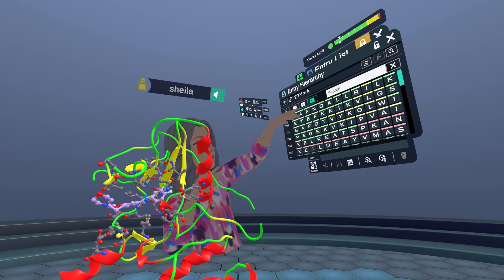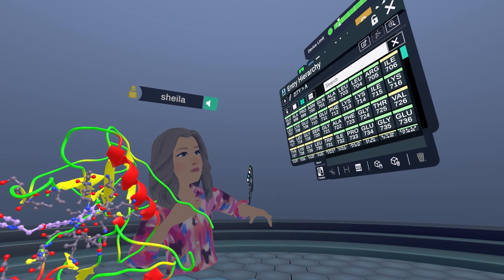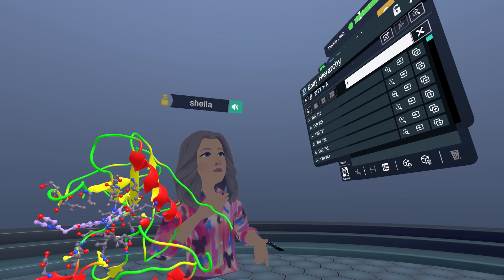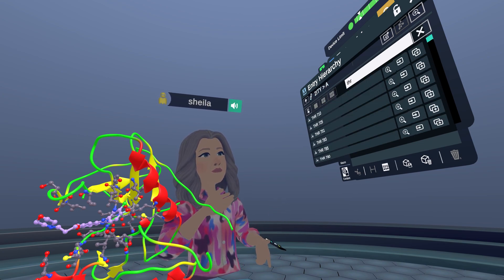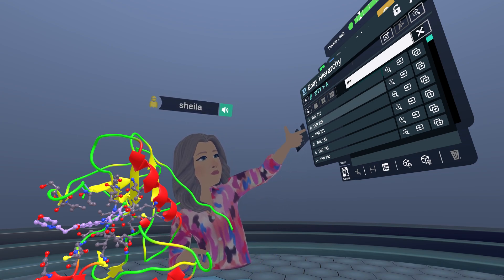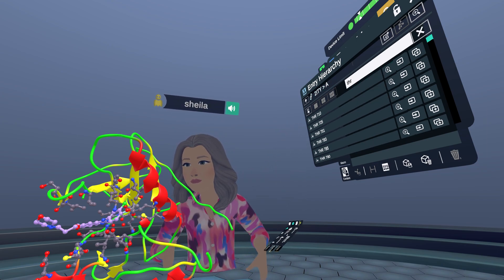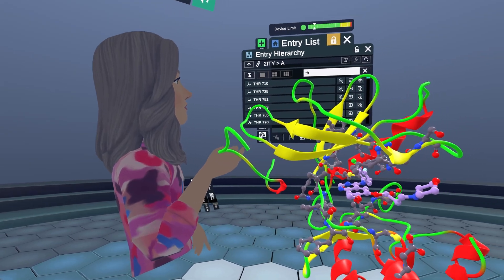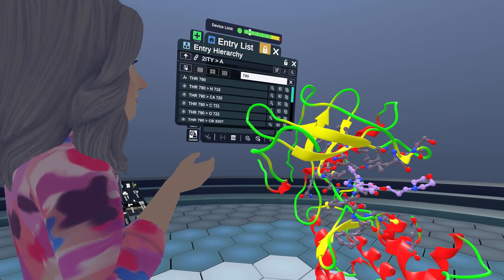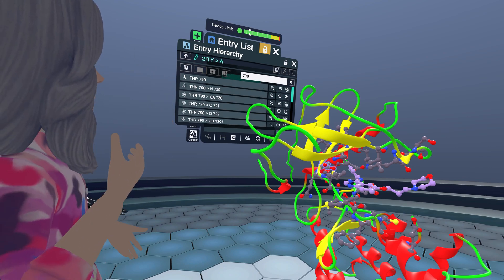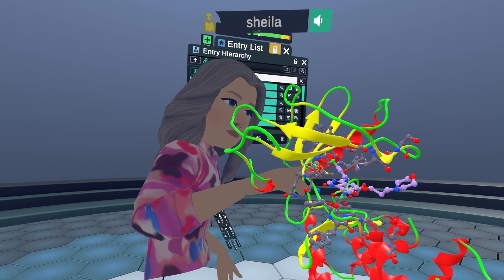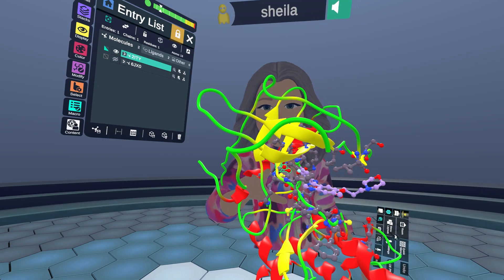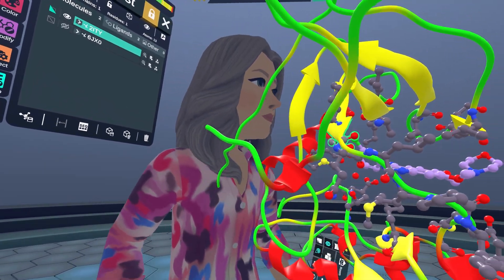You can look at a different scale and see the residue number, so I could scroll through and find residue 790. I can find all the threonines by typing in the search bar and hitting enter. If you know the location, like 790, you can type that in and simply get residue 790. Now we have that highlighted in the protein, and it also appears as a partial selection on our entry list because we have that residue selected.